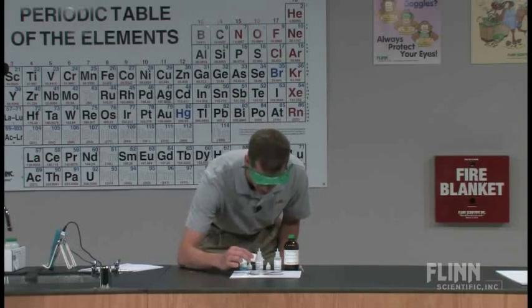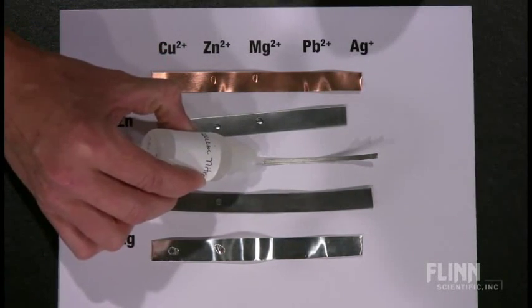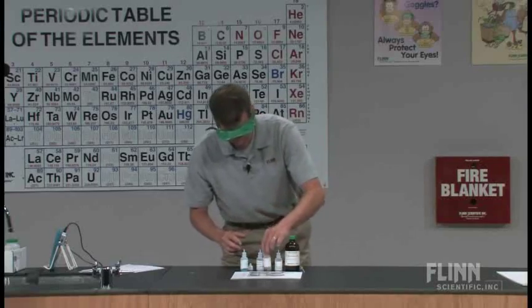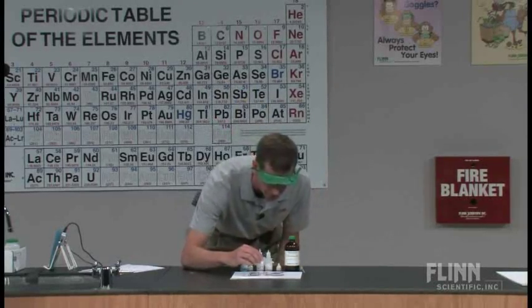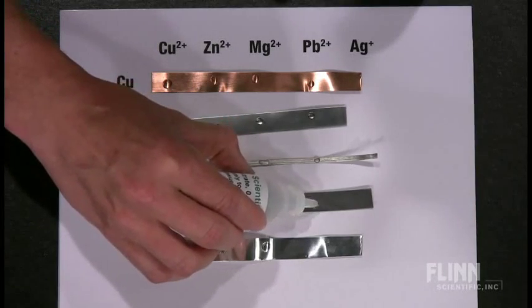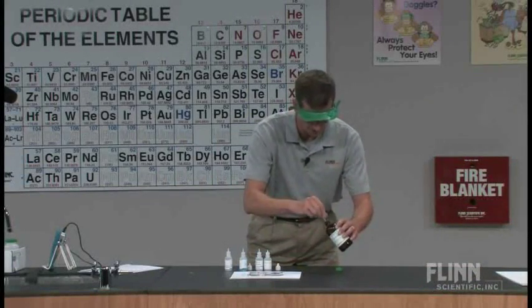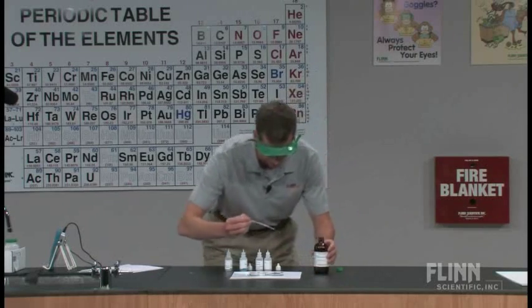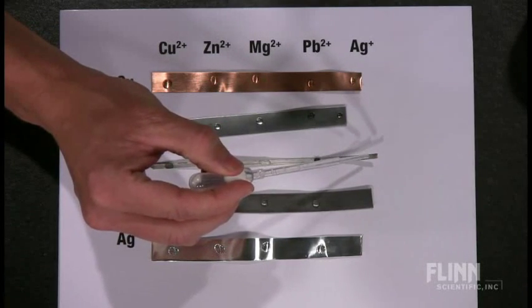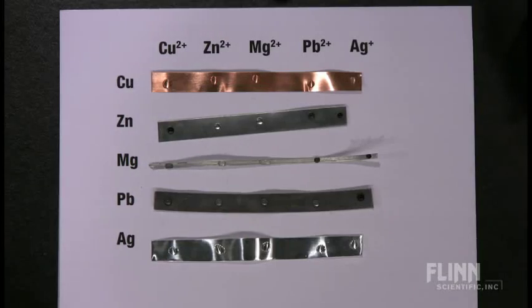We'll move on to the magnesium nitrate. Not only do you get very quick results with this lab, but you also see the relationships between how the metals react. We're actually building, in addition to a data table, an activity series of metals in a quick and dirty method here. We keep our silver nitrate in here so it doesn't reduce down to solid silver.